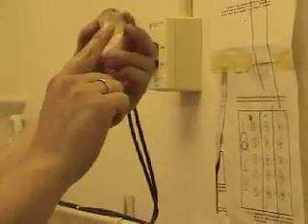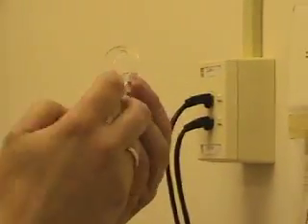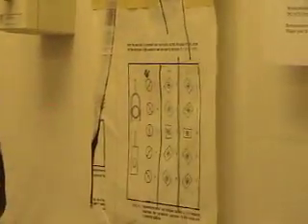We're going to measure them in 15 different positions. We measure them in this device, how we load it in here. So here is a pretend sample, and it's got a lab arrow on the top here, and this arrow is our reference point for measuring this, and we're going to load it into this little cylinder. So we'll do that, and up here we have our chart for the positions, for all 15 positions.